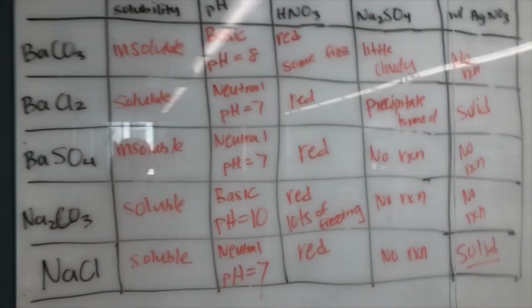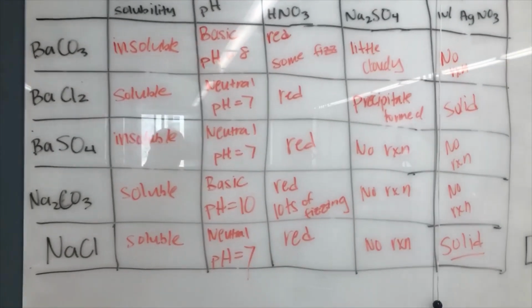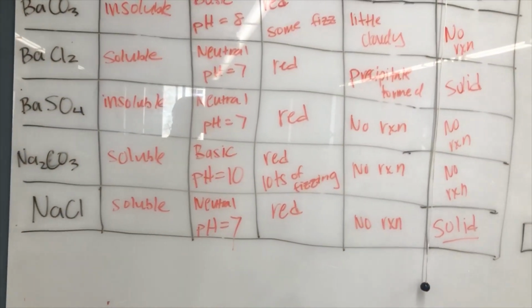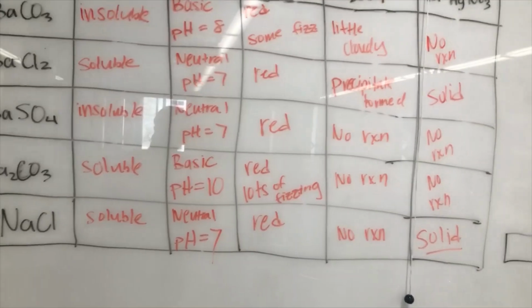We have all of our observations made. Again, I will post all of this data, so don't be stressed out trying to rewind to make sure you're catching everything that I'm saying.